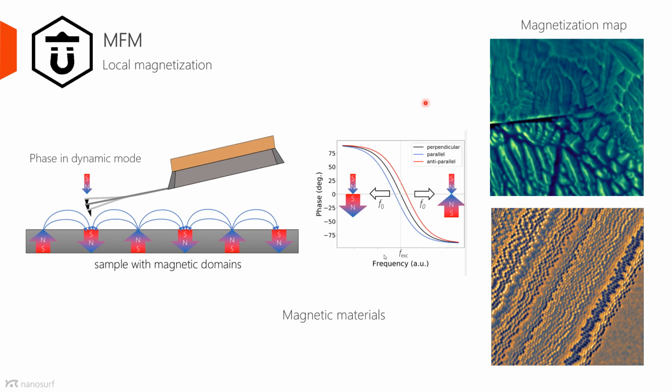Magnetic force microscopy, or MFM, is a technique used to measure the stray magnetic field above the sample. It uses magnetically coated probes and is typically a two-pass technique. The reasoning behind this is that your van der Waals forces are very strong close to the surface, but they decay very quickly, while electrical and magnetic fields tend to decay more slowly.